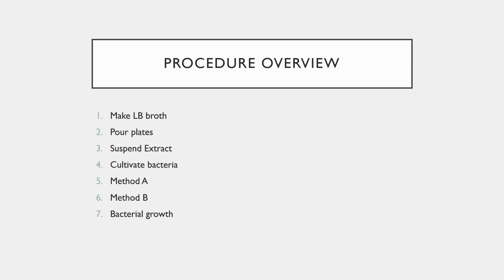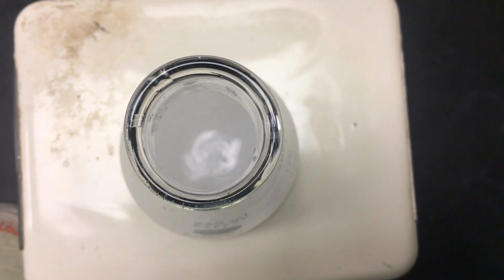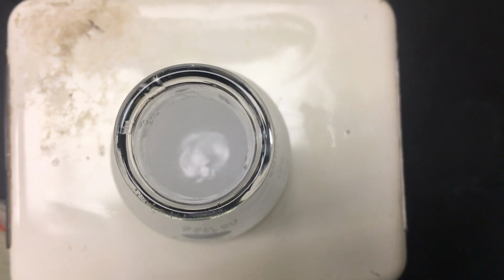The basic procedure is to make the LB broth, pour the plates, suspend the magnolia bark extract in water, cultivate bacteria, then follow the steps for method A or method B for adding the extract, and then wait for bacterial growth.